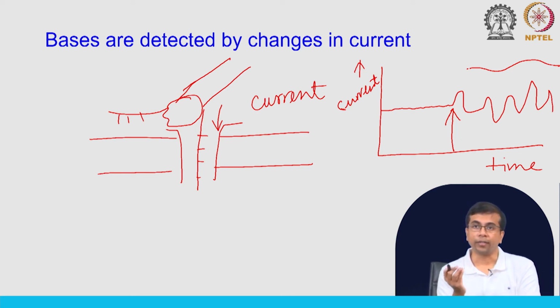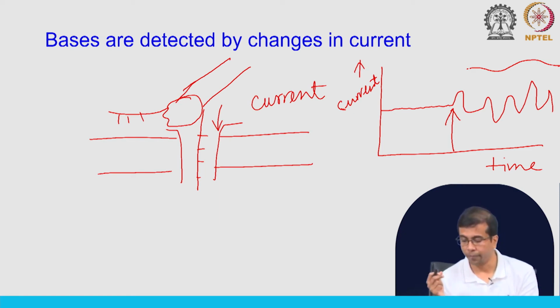Okay. Now, as you can probably imagine, this is quite a difficult process, right. So, identifying which bases are passing through the nanopore from the current signal. One of the questions you might have is: is this detected by single base? The answer is actually no. This is detected by a pattern or combination of bases that are passing through, right. A combination of bases will have different patterns, and you can find these unique patterns from these combinations. Okay. So, I hope the general principle of how nanopore will detect the DNA bases is clear.